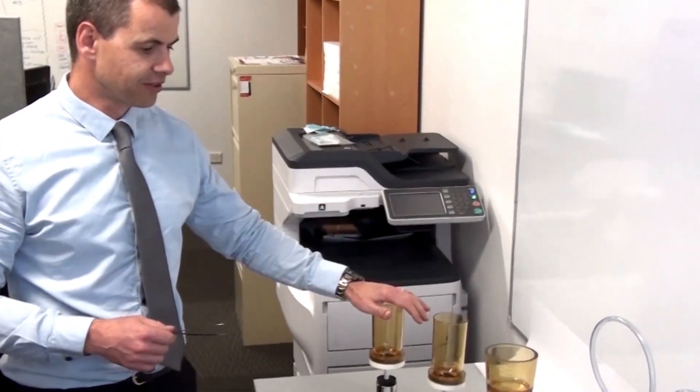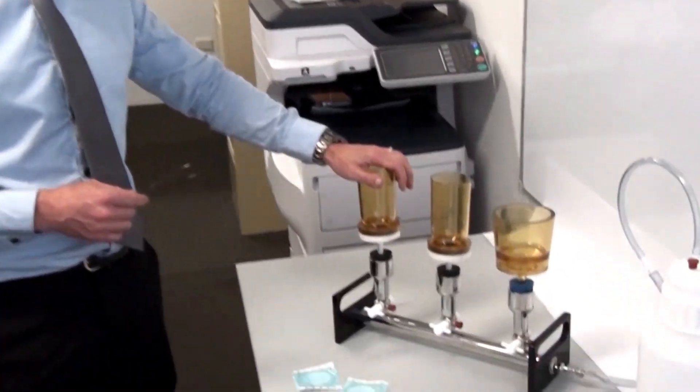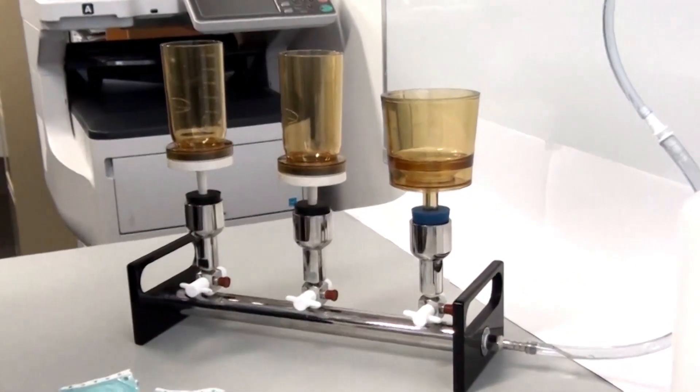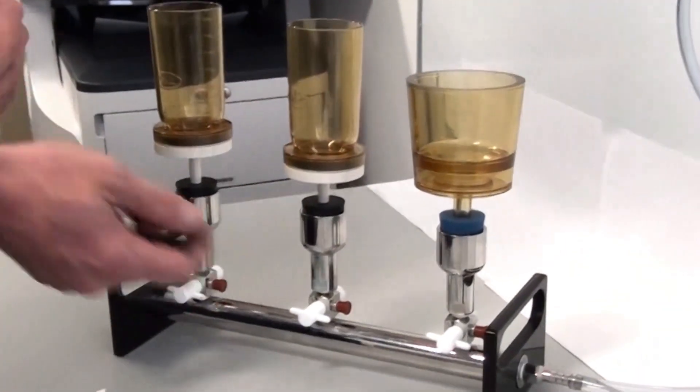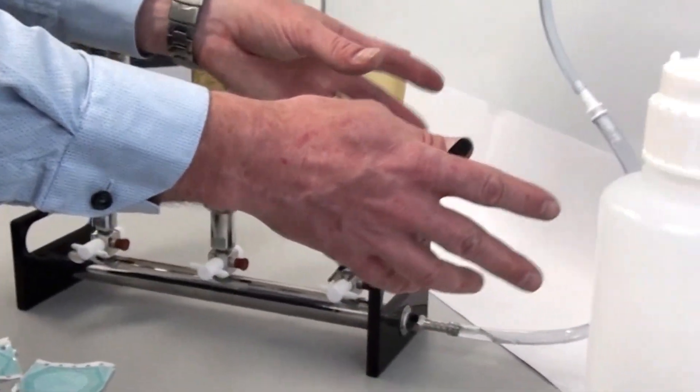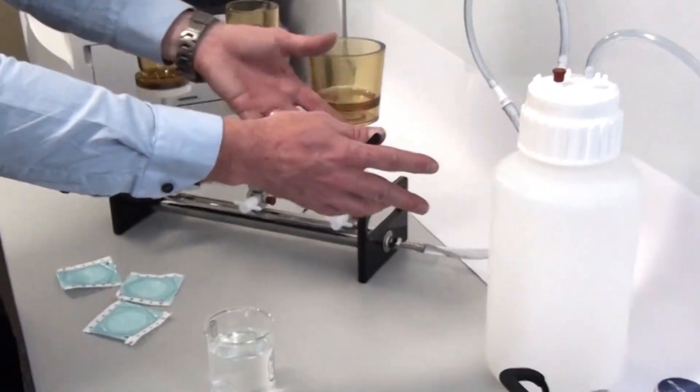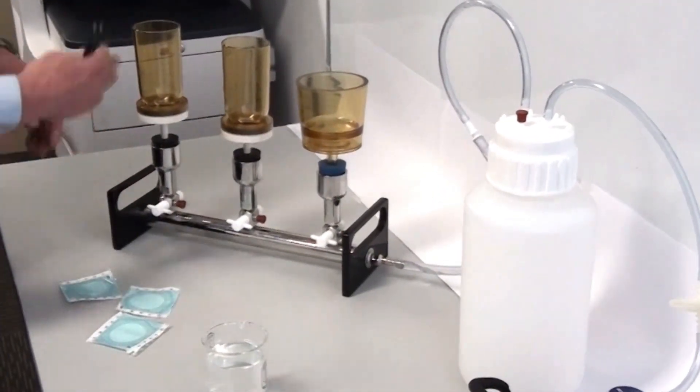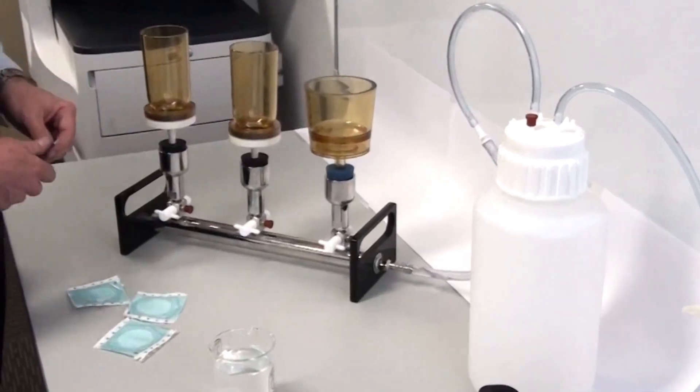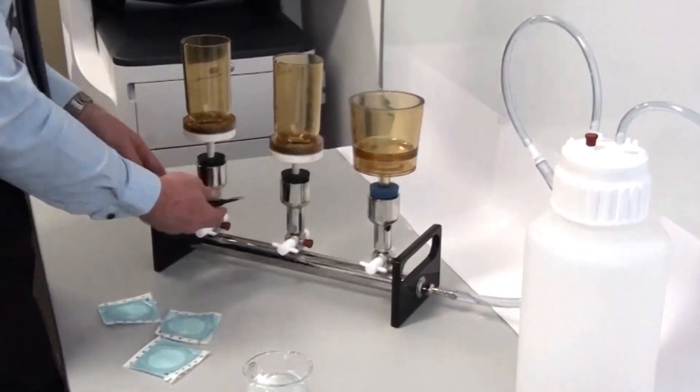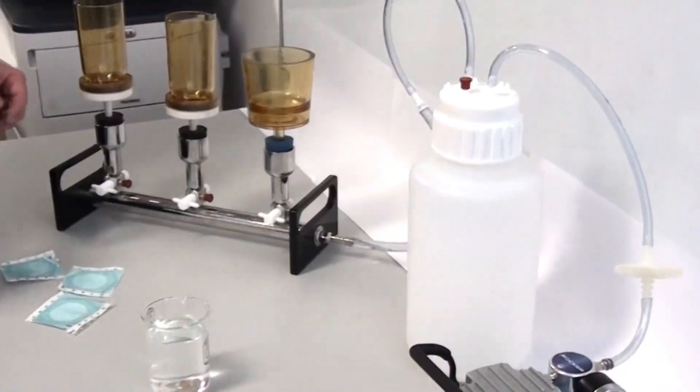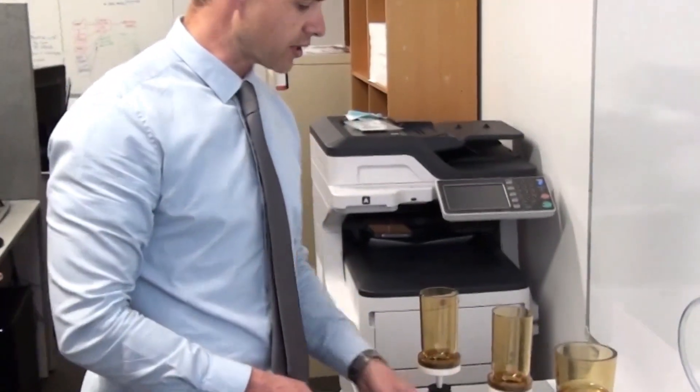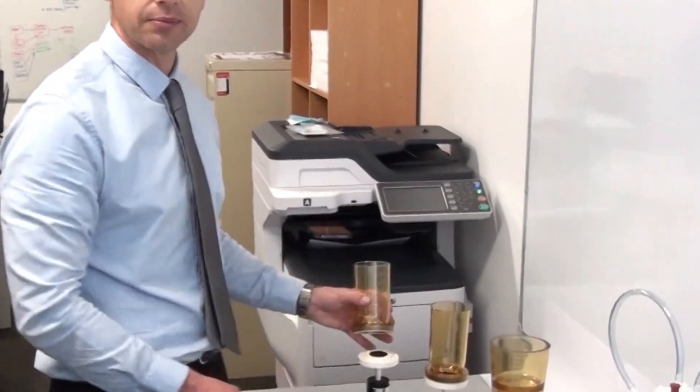Okay. So here is the microbiology specific filtration setup. Now it differs to the industrial one that I just demonstrated in that the filtrate that is collected is collected in the one vacuum bottle. As opposed to the industrial had the separate flasks collecting each filtrate from each line. Whereas in this manifold system setup, all the filtrate is collected together. So typically be used in a microbiology lab, where you're not interested in the filtrate, you're just interested in the bacteria that you're collecting on the membrane.